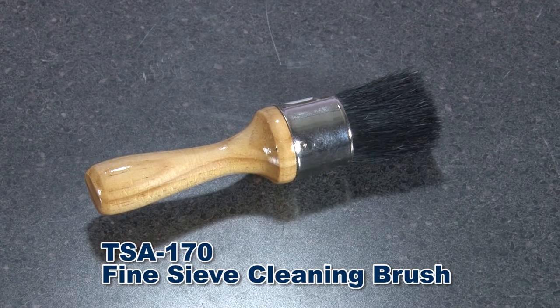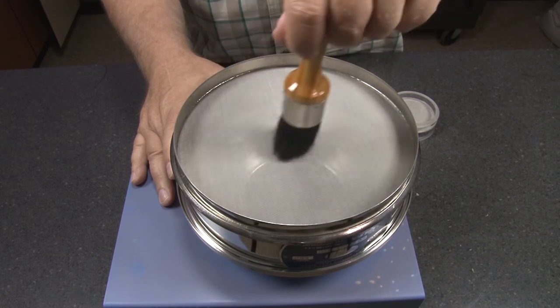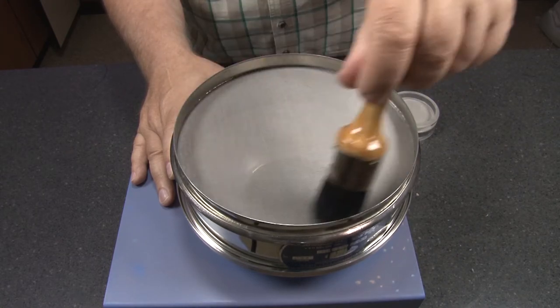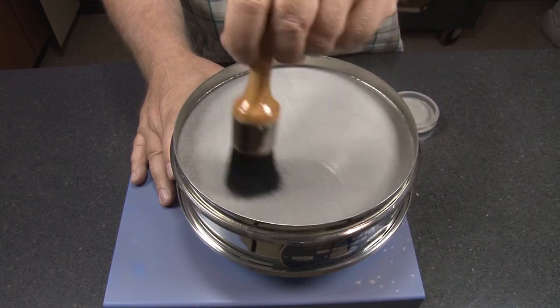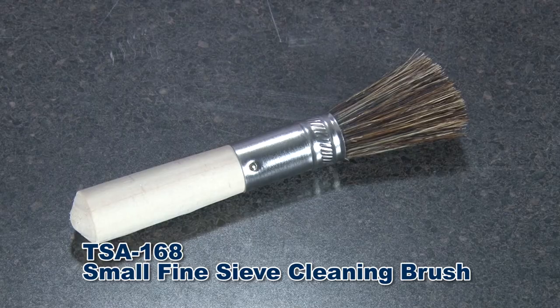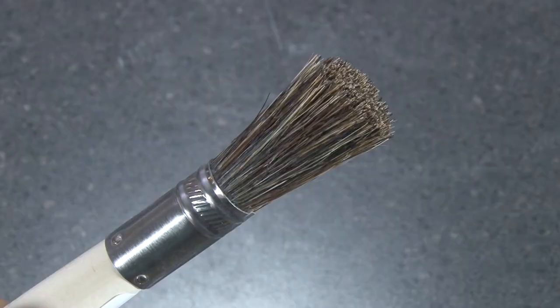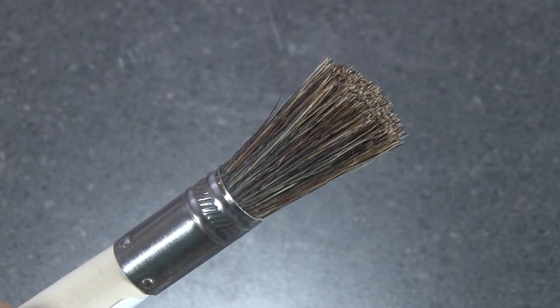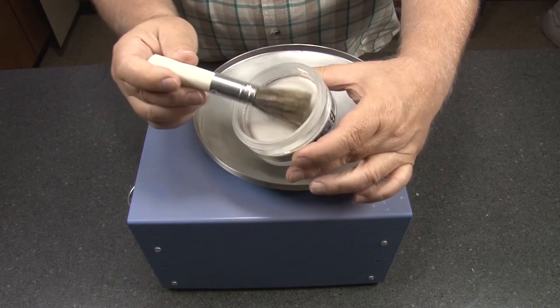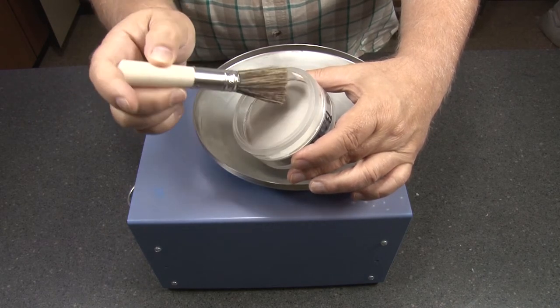The Gilson TSA 170 fine sieve cleaning brush has soft natural bristles, nickel steel ferrule, and a lacquer wood handle for cleaning round test sieves with number 16 and finer wire cloth. Gilson's TSA 168 small fine sieve cleaning brush has soft 100% china bristles in a round three and a quarter inch ferrule and is tapered for easy use with fine mesh sieves or precision electroform sieves.